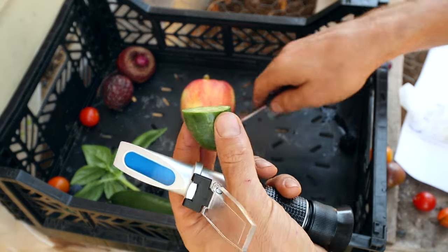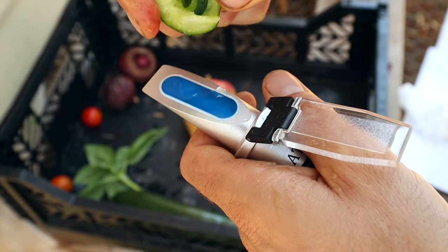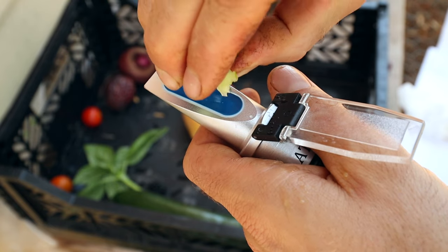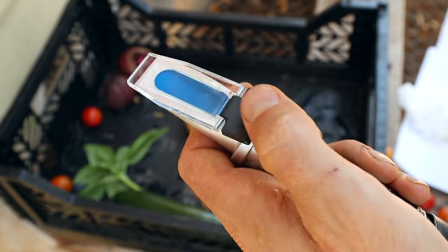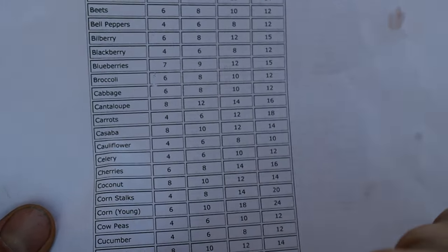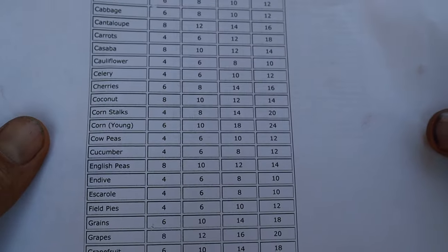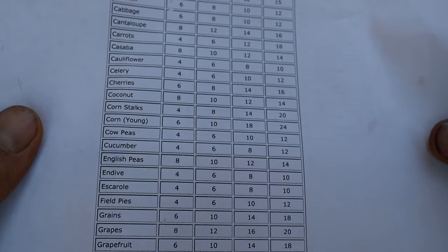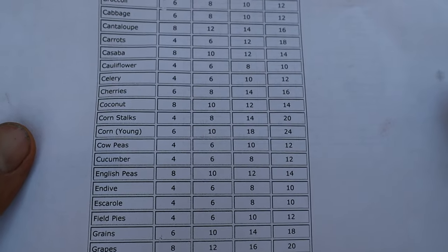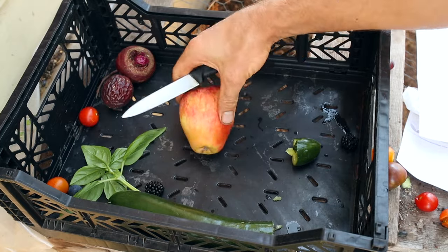Let's try out a cucumber — this will be a little more difficult to get juice out of. The cucumber is only about 5 — I'm pretty surprised because they taste amazing. That's between poor and average, but if you taste it I would not rate it like that. All the customers tell me it tastes amazing. But that is the sugar, sucrose, and dissolved solids measurement, so it'll be good to measure this over time.